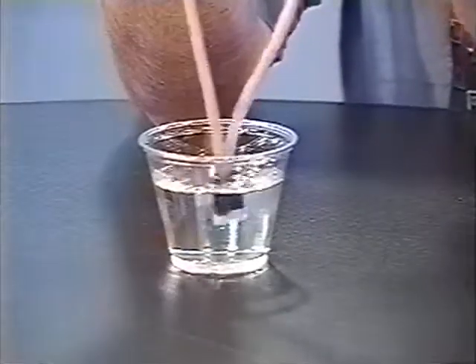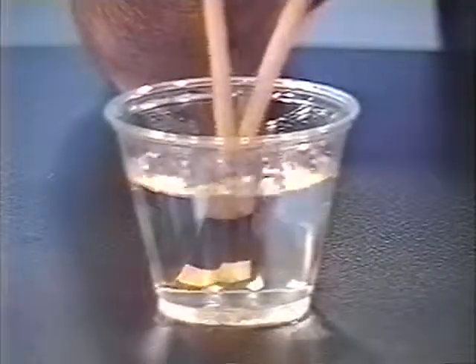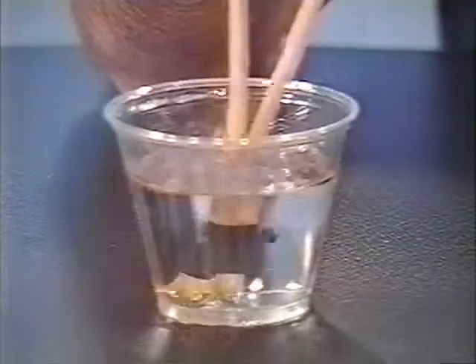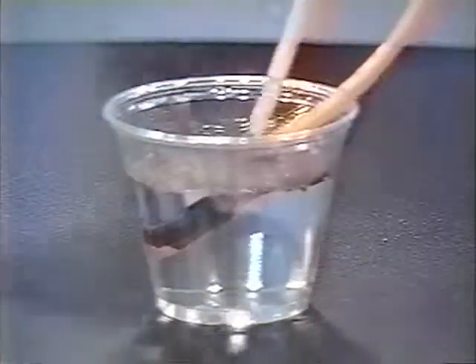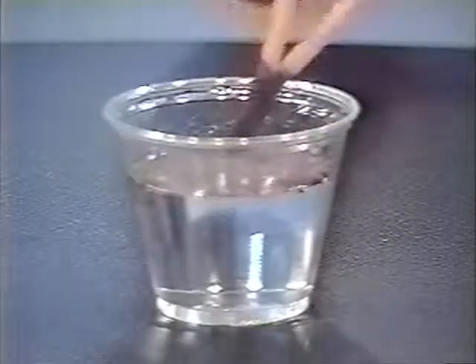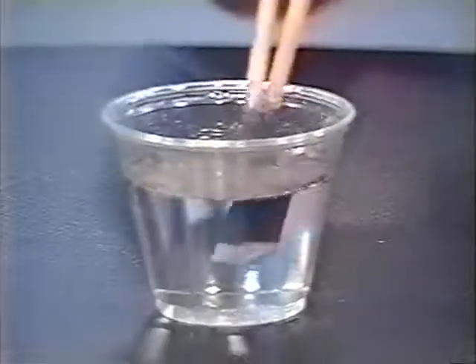This will produce some underwater fireworks. And we could keep going, but we're producing a little bit of soot in the vicinity. So I'll stop now.